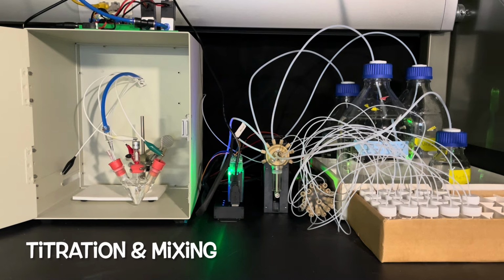Once the square waves are finished, the analyte is titrated in and mixed. Then the same frequency mapping is completed here.